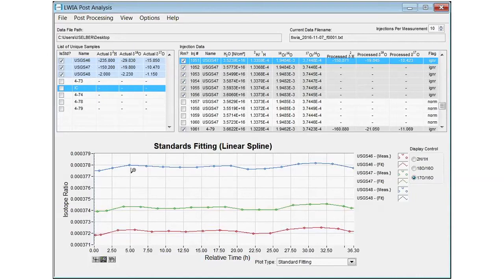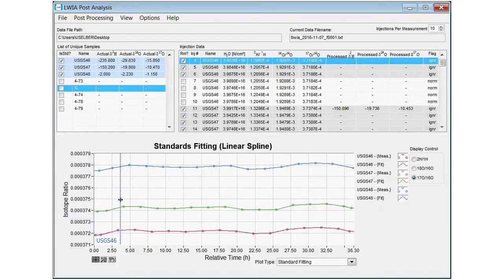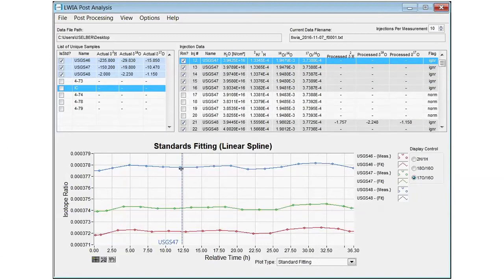the data. Now if we want to standardize a point, say this sample, say sample number 7, say we want to utilize this sample right here.